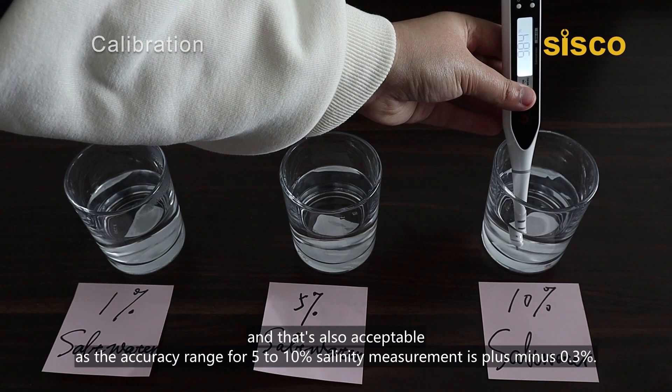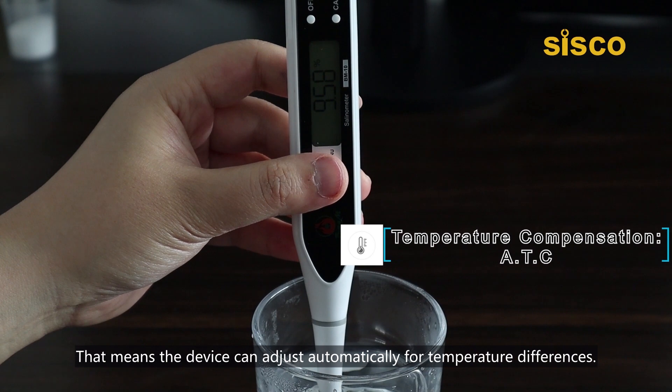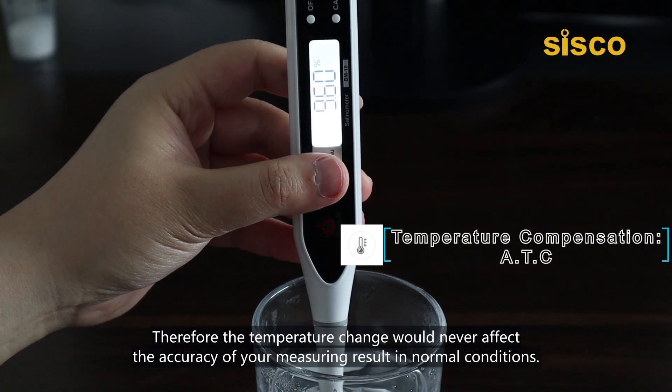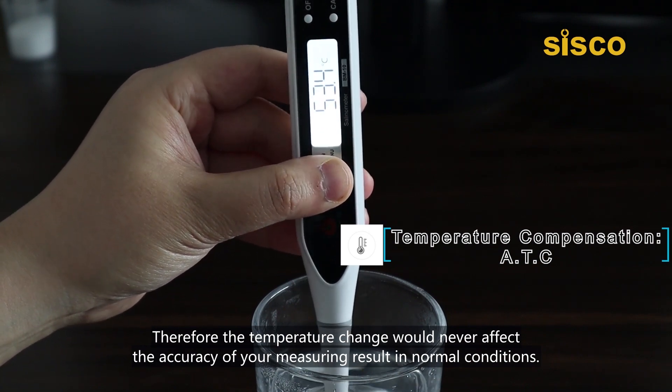In case you're wondering, this salinity tester has built-in temperature compensation. That means the device can adjust automatically for temperature differences. Therefore, the temperature change would never affect the accuracy of your measuring results in normal conditions.